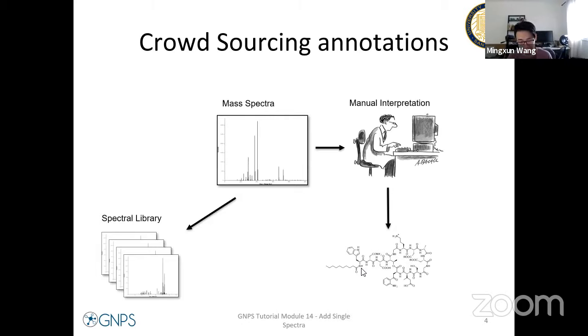And so we find that that's a way better method to start covering the chemical space that actually is relevant to people's research. And so just kind of historical context, GNPS, we started this in 2013, and back then there were a few resources out there for the creation of spectral libraries, but since then, because of community efforts and other resources, libraries have grown tremendously. And so these days we've got about 150,000 reference MS/MS spectra at GNPS, but it only annotates about 5% of the data. It's better than the 0.5% or so we were seeing back then, but we still have a long way to go.